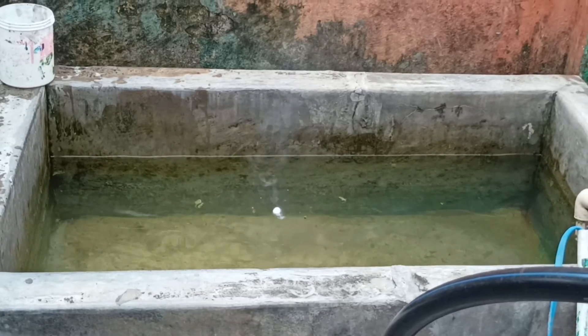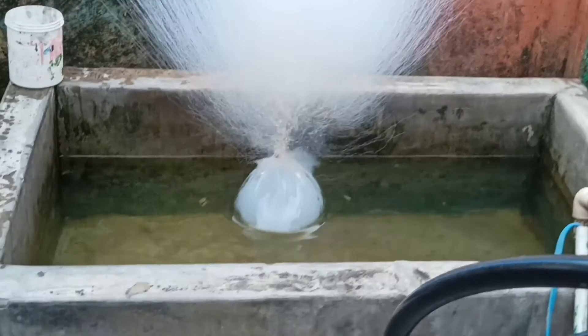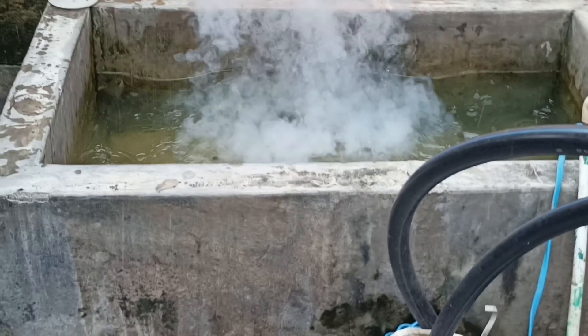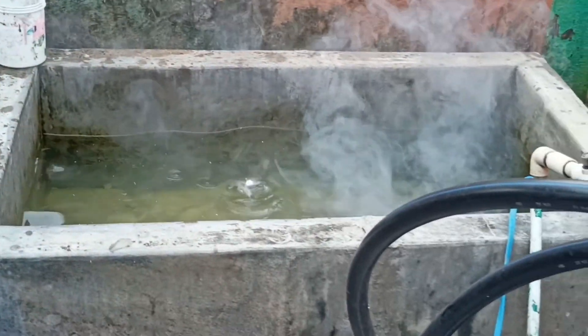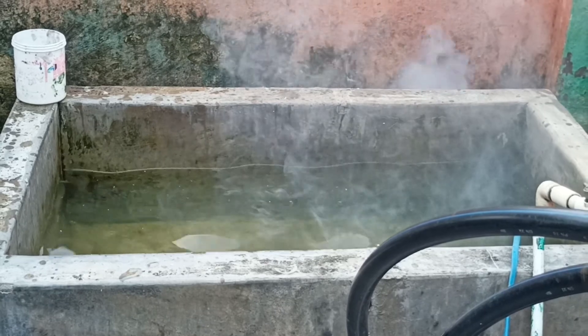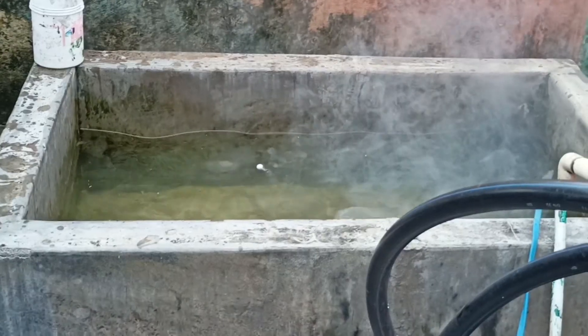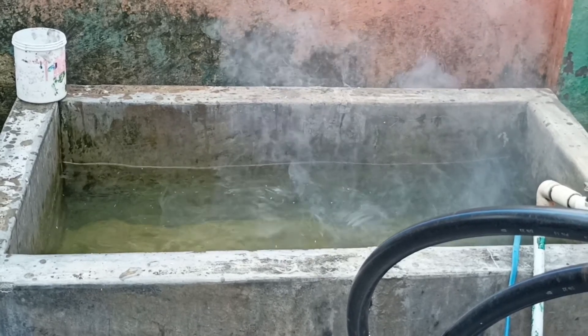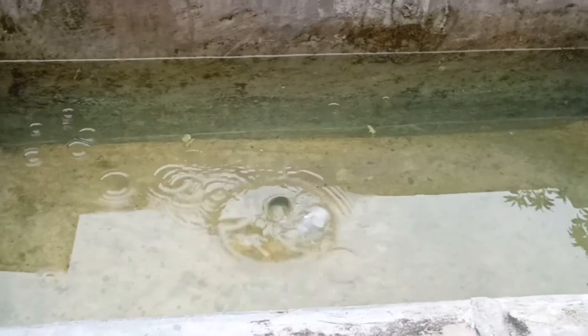When the sodium reacts with water, all the sodium ions are clustered together and are positively charged. All those positively charged ions want to separate, so they rapidly — due to electromagnetic forces — explode and push apart. Along with that, a hydrogen explosion also happens. The hydrogen formed from the reaction and the oxygen present in the air together result in an explosion.